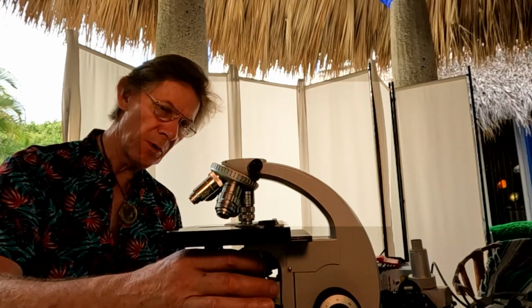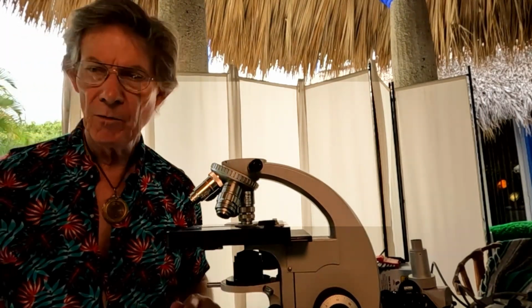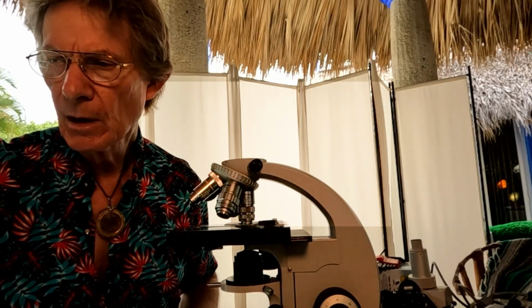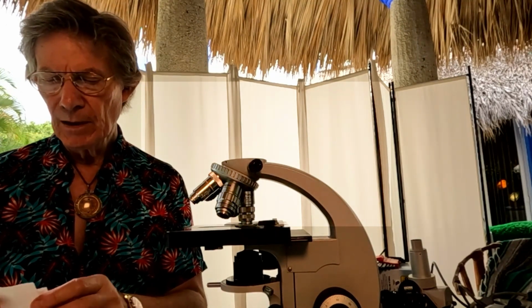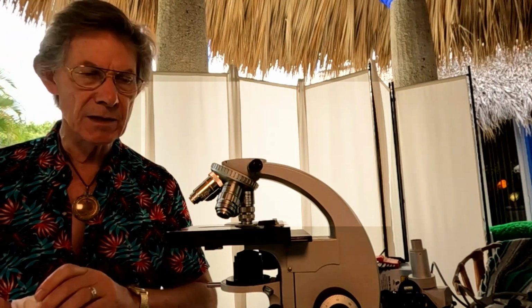Now, a dark field microscope, and it's very important that we use that term right now. The reason we use dark field and not bright field, and I also do not use something called phase contrast, and some of the people watching this video might not be happy with that term, but I was taught dark field back in 1995, and I still feel that it is the absolute best technology for evaluating live blood.